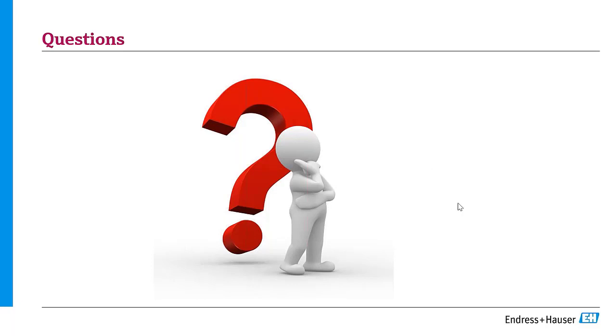Okay. Does the CUA252 impact the measurement? I see that you have a vertical orientation for the panel setup. I'm sorry, Gail, can you repeat that? Of course. Does the orientation of the CUA252 impact the measurement? I see that you have a vertical orientation for the panel setup.